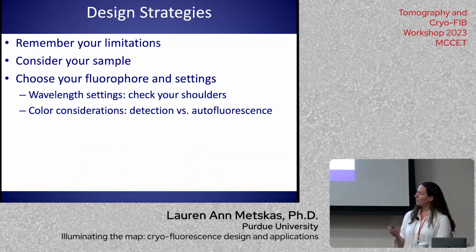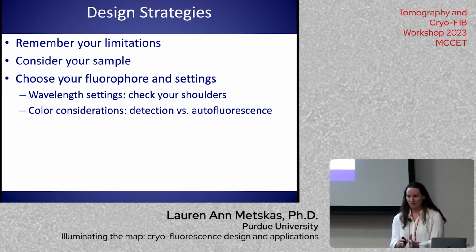All right, color considerations. Of course, I keep saying autofluorescence is going to hit your green channel, so we tend to go red. There's another factor at play. Cameras tend to be more sensitive in the green channel than the red. So if your fluorophore is going to be dim, you're going to have to make a decision between battling with the autofluorescence versus maybe not detecting it as efficiently in the first place.